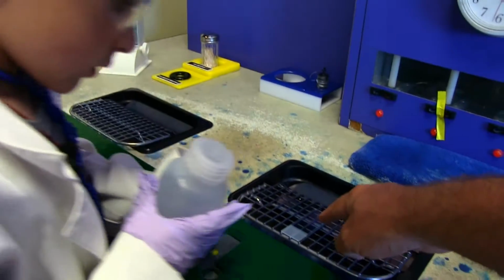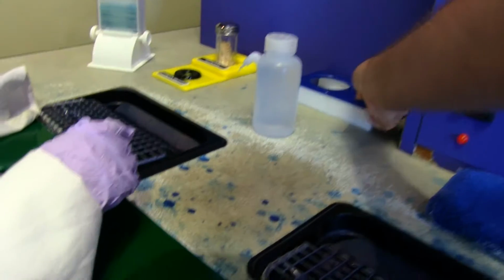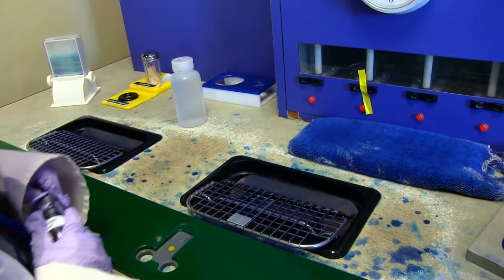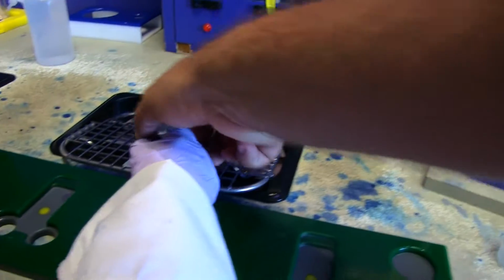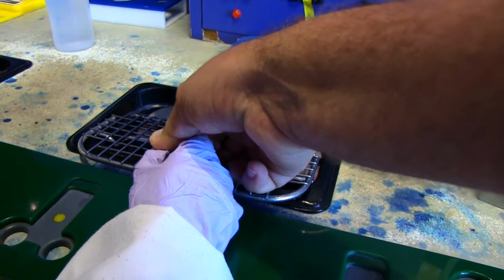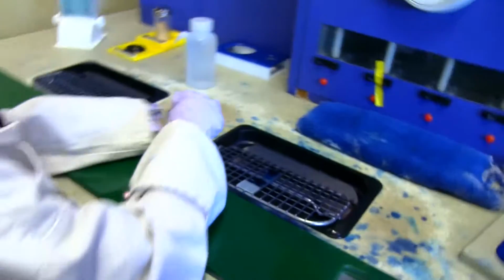onto the dried cells. Okay. No, that's water. Methylene blue, right here. Put 2 or 3 drops. Okay, I choose 3. Is this my center? 1, 2, 3. Okay, that's plenty. There you go. Okay, cap it off and put it back up there.